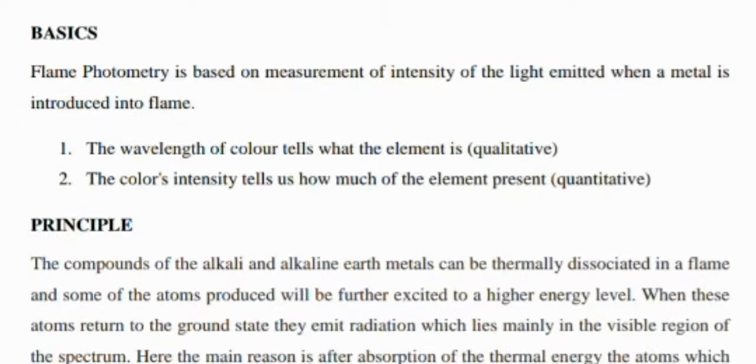Now the basis is that the wavelength of the color tells us what the element is, which is qualitative, and the color's intensity tells us how much of the element is present, which is quantitative.